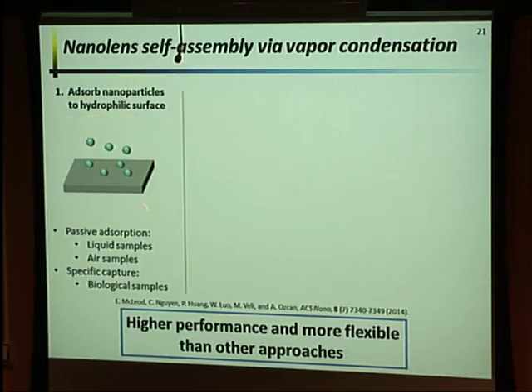We take the particles we want to detect. We somehow attach them to a hydrophilic surface. This can either be done passively, in which case you just dump everything from your sample onto the surface, or you can have specific capture. I'll show this maybe 10, 15 minutes later, how we can do this with specific capture.